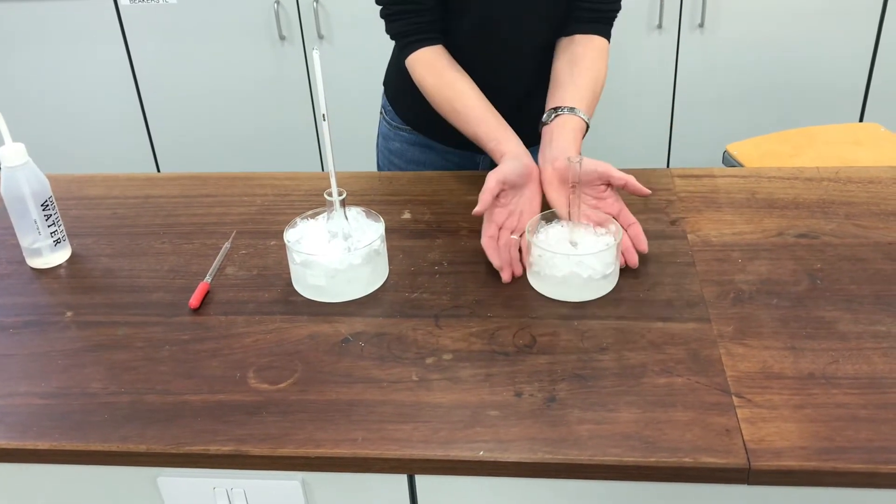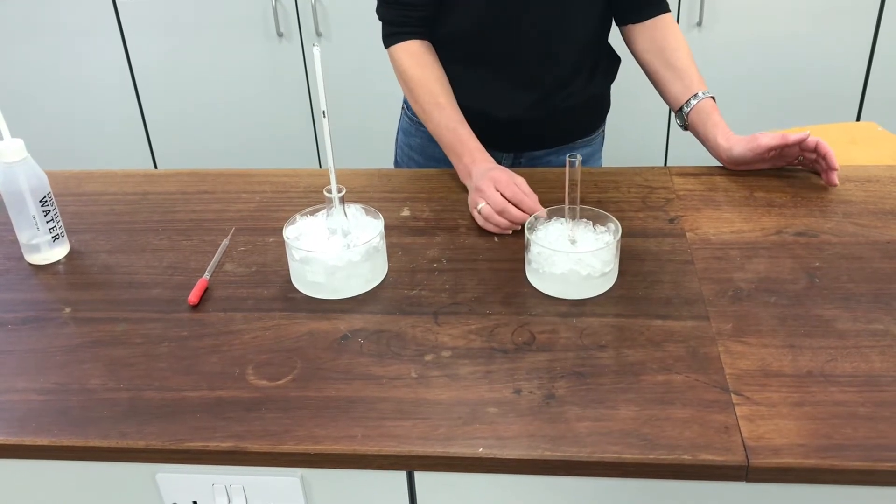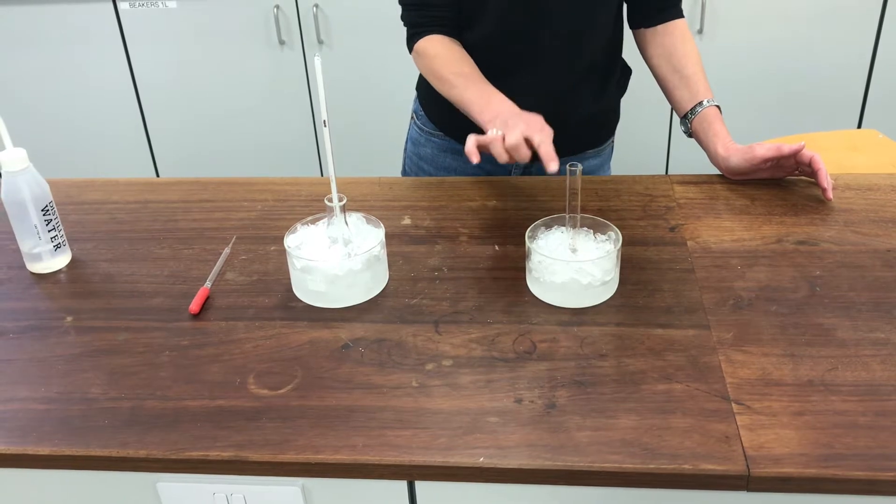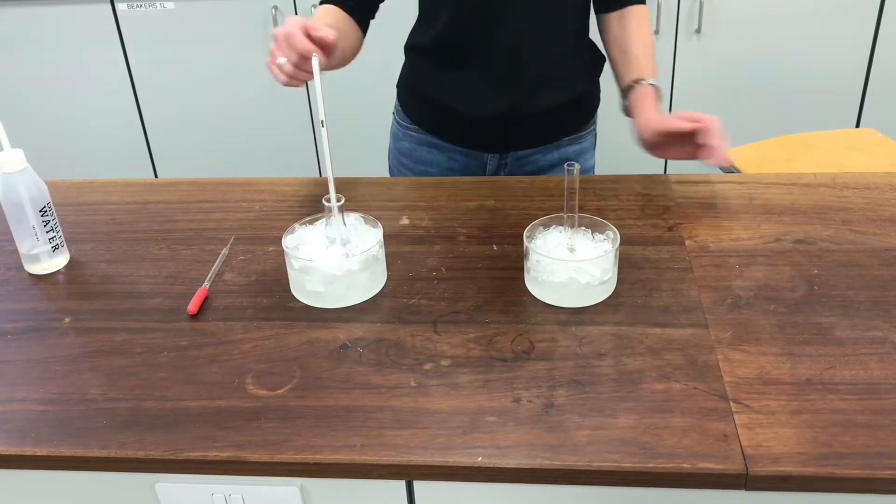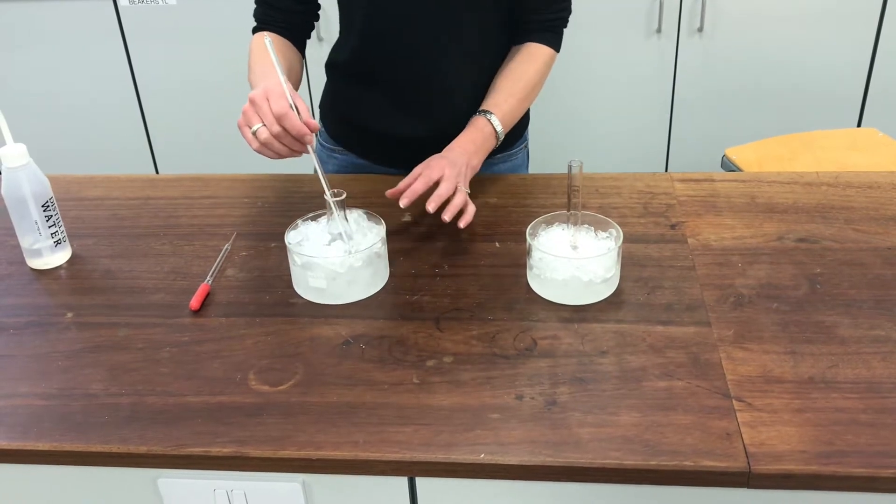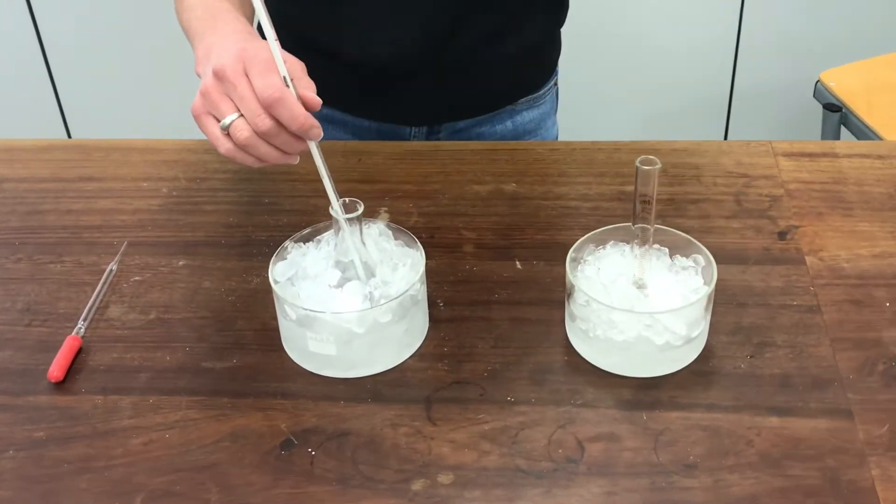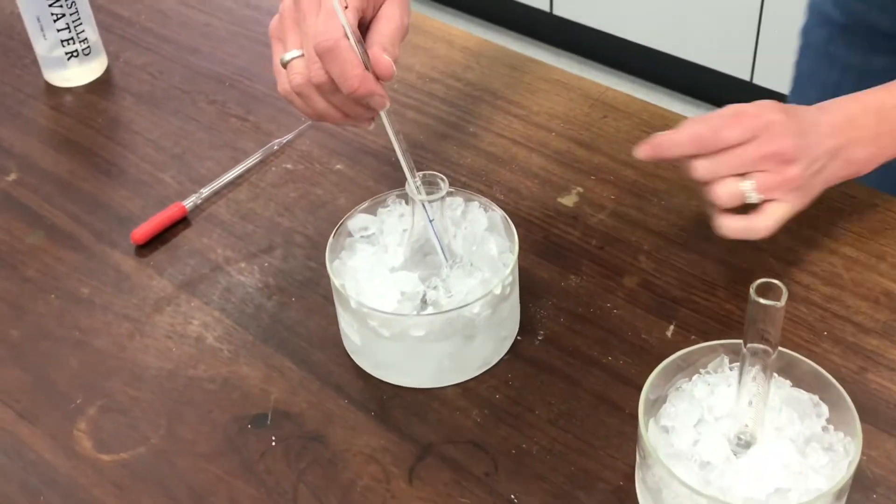So I've got first of all here a nitrating mixture. This is mixed up from equal amounts of concentrated nitric acid and concentrated sulfuric acid. I've got a total of 4 cubic centimeters of that nitrating mixture in this measuring cylinder. In this vessel over here, this conical flask, I've got the methyl benzoate. And I've already added 5 cubic centimeters of concentrated sulfuric acid to this one as well.